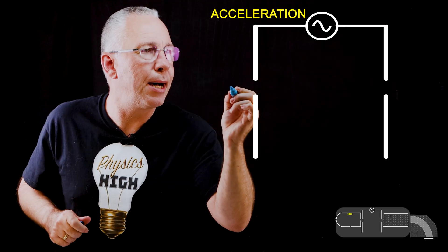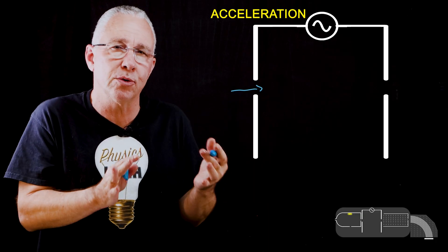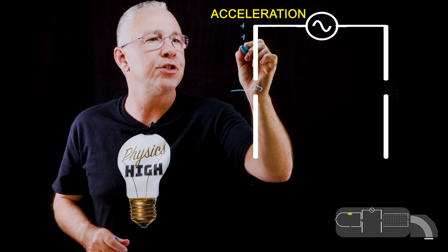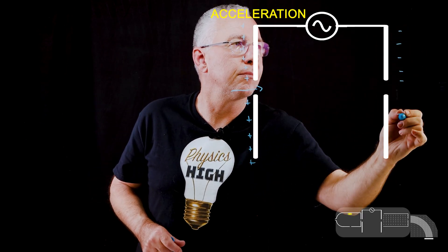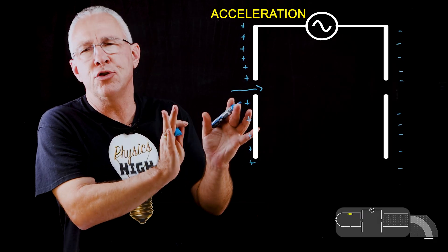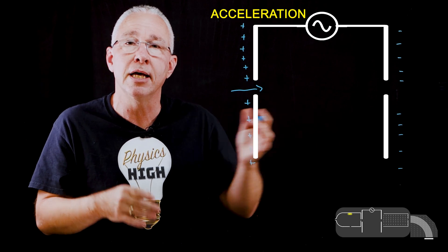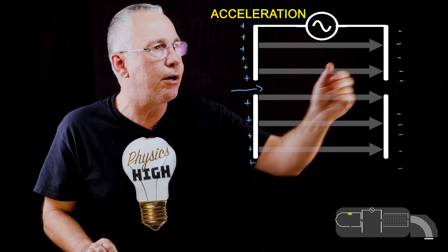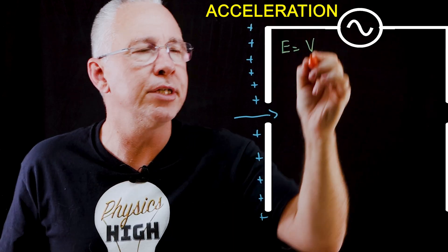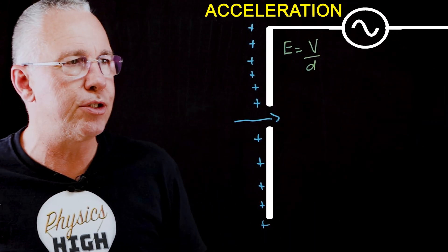Next is acceleration. Our particles are now entering here. And what I have are two plates that have a potential difference spread across them. This side will be positively charged, and this side will be negatively charged. Now I have an alternating voltage supplied here, because generally speaking, it's usually not just one set of plates so that we can increase the velocities incrementally. I have now an electric field. Now that electric field is equal to simply the voltage that is applied across these two plates, divided by the distance between these two plates.